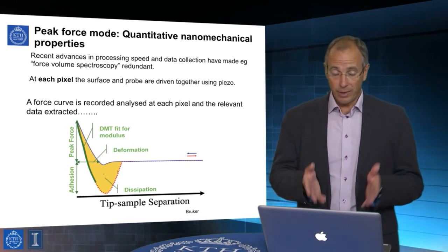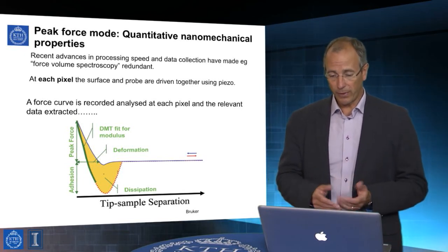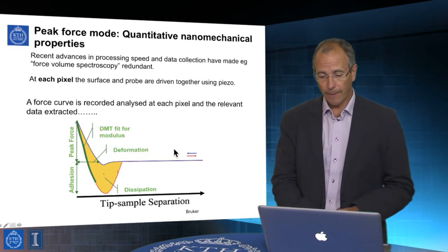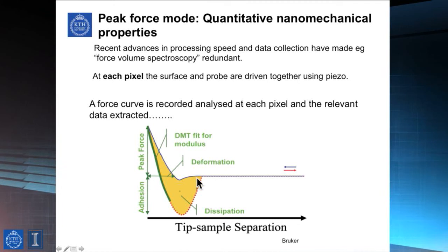Now, the way the software works in this example is that it analyzes the force curve as we see in this example. So just remember, here we're out of contact, we come into contact, we experience a small attractive force in this case, and come into some sort of physical contact at the tip and surface.